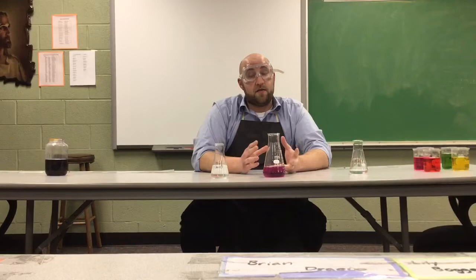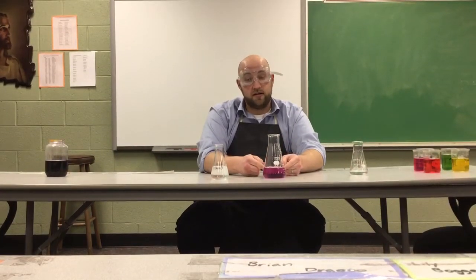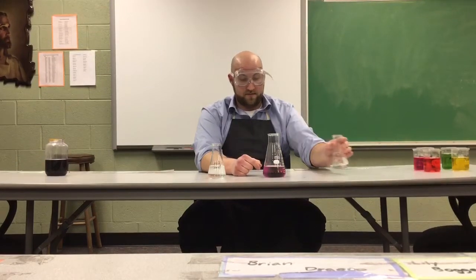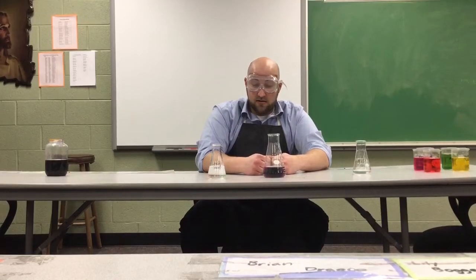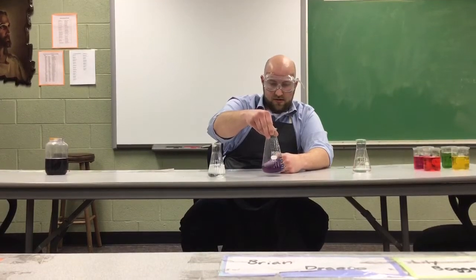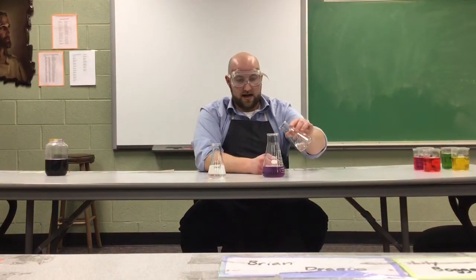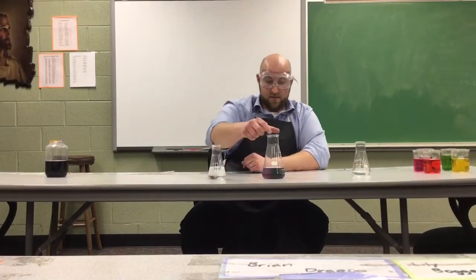You can see a little bit of how those colors interacted, but now I've got a color that's a little bit too much red. So I have too much hydrochloric acid — I need to add some more sodium hydroxide until I get that balanced neutral. As it starts to add, we can see pockets of a different color, and then we give them time to mix together and get us a little closer to that neutral color. That is pretty good — maybe a little bit red still, so I'll add a touch more of the base until I get it perfectly balanced out.